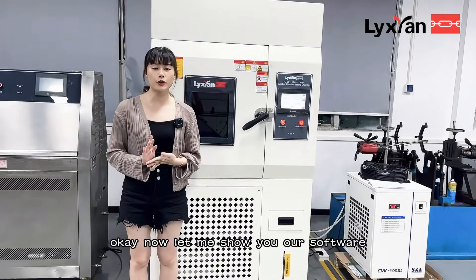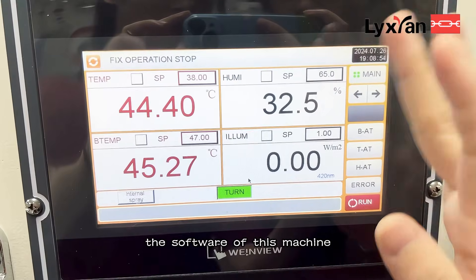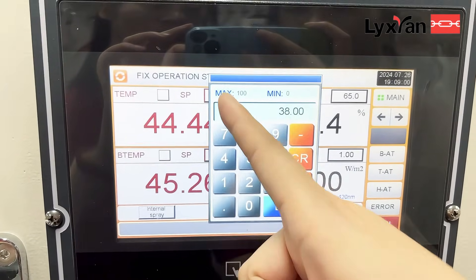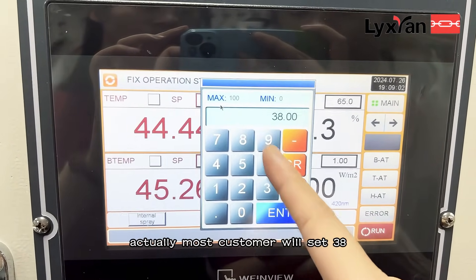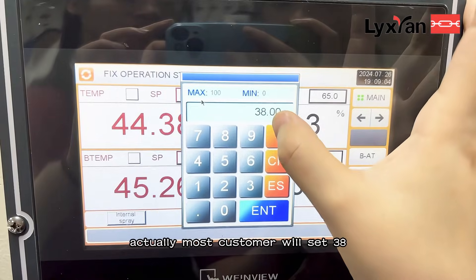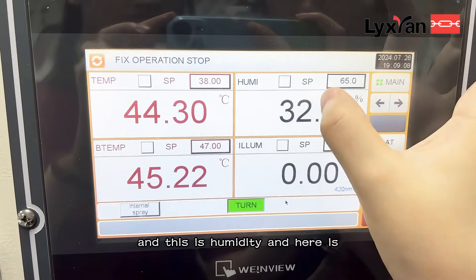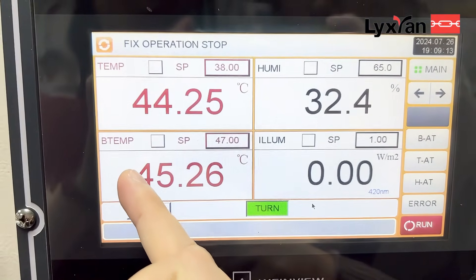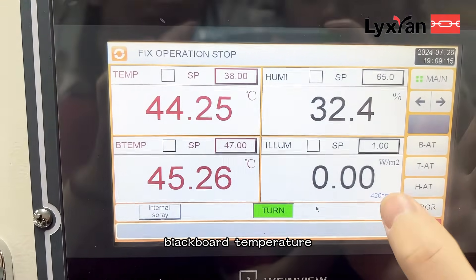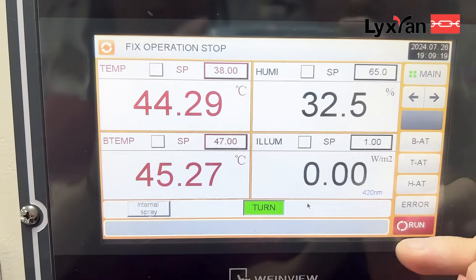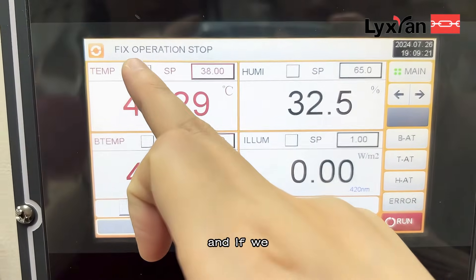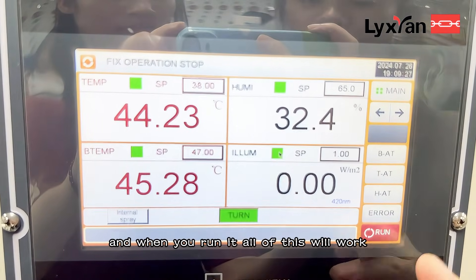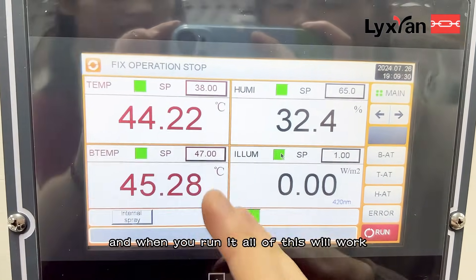Now let me show you our software. Here is the temperature, and we can set it. The max is 100, but most customers will set 38. And this is humidity. Here is blackboard temperature. Here is illumination. And if we enable here, here, here, and here — when you run it, all of these will work.